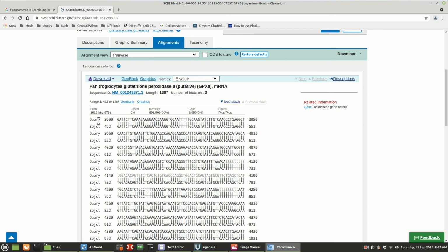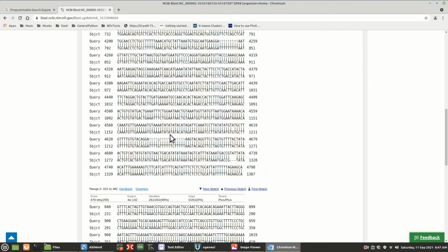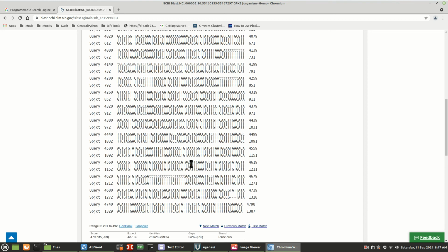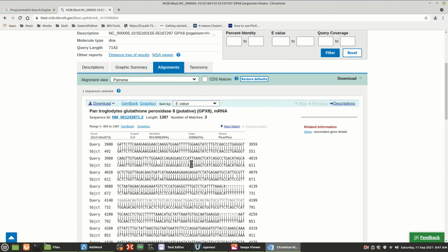Let me think which one. So pan-troglodytes would be the query. No, the longer one. The longer one is going to be the human one. So whichever one is the longest, that looks to be the top one, that's going to be the human. The chimp was the one that was RNA. That's the subject.